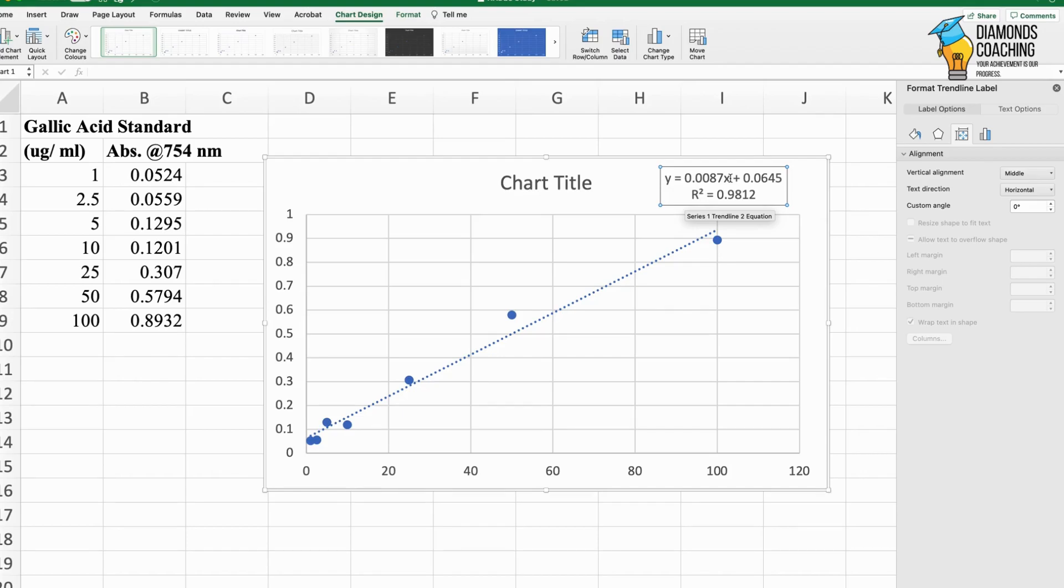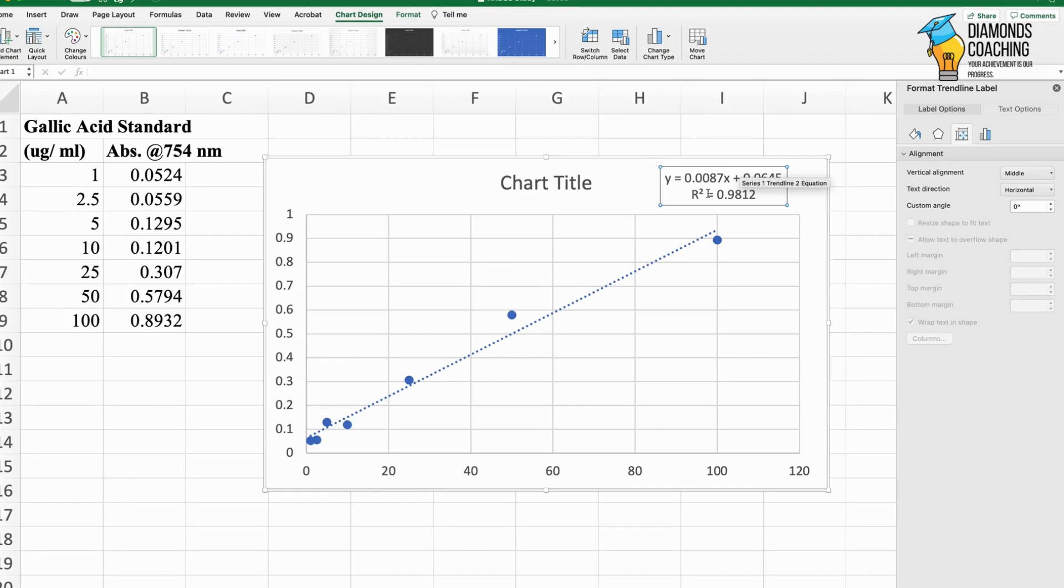So this is how you plot the standard graph. This is how, in the second step, you get the equation from where we can further calculate our values of the desired parameter.